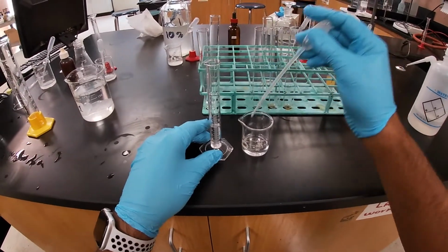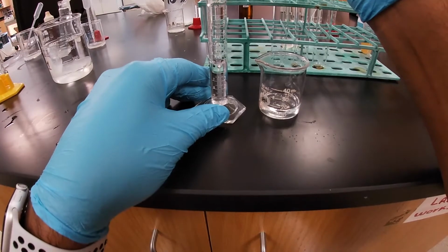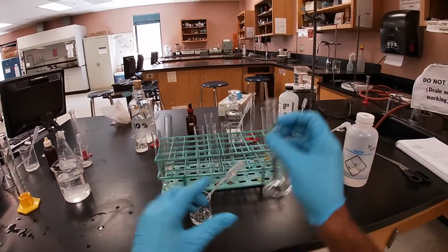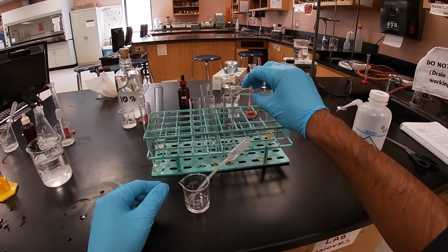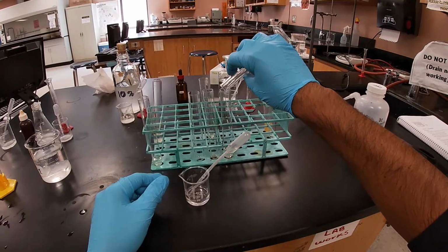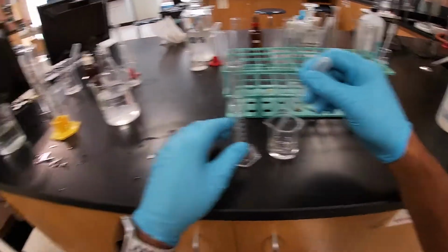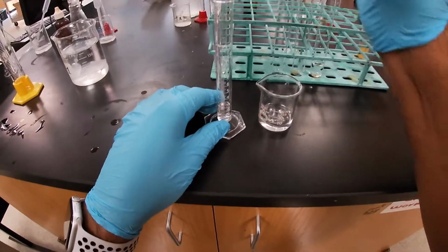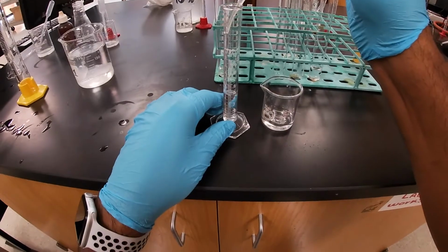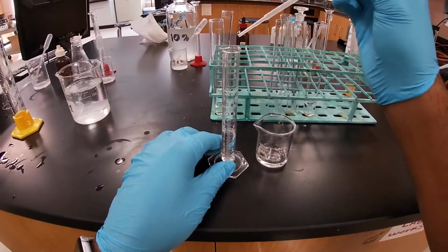You can just go ahead and measure out all of them if you like. So we got the first one. We're gonna put it in our first test tube. And like I said, we're gonna do each individual test after initially dunking our dialysis tube. A little bit more.